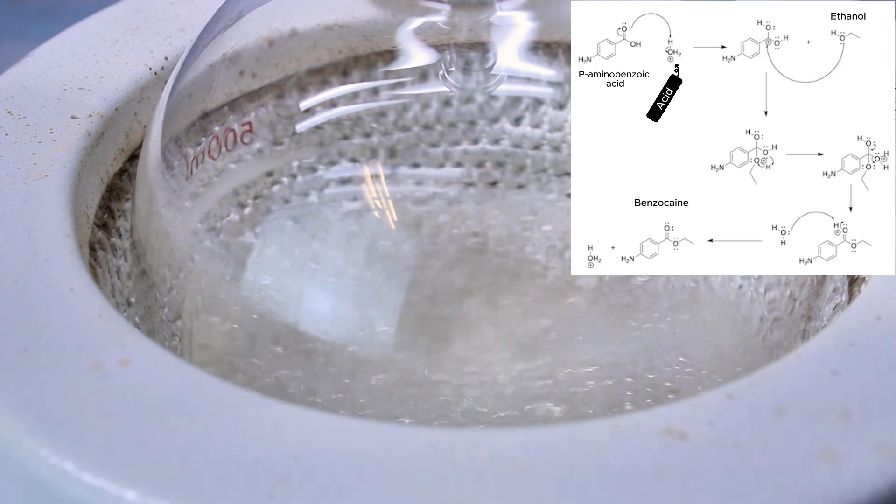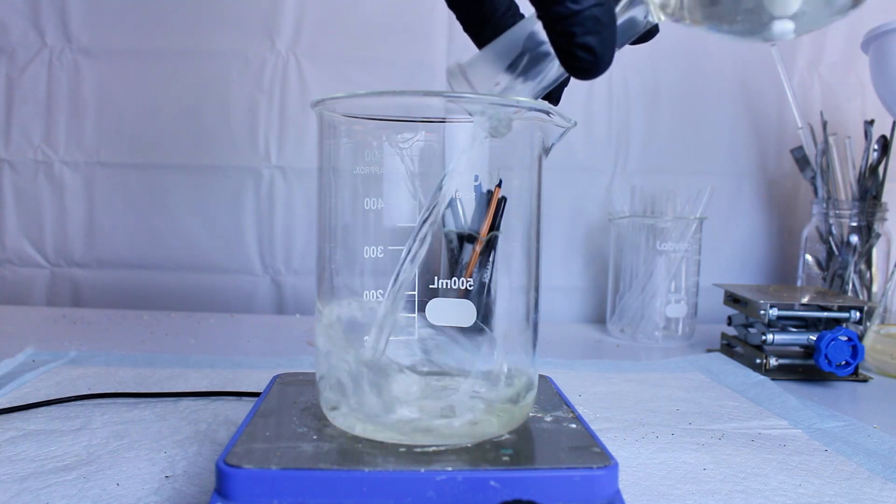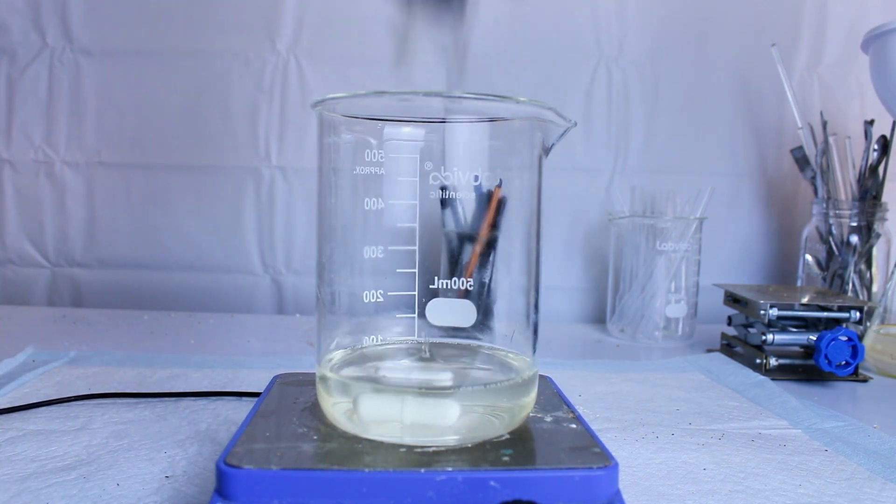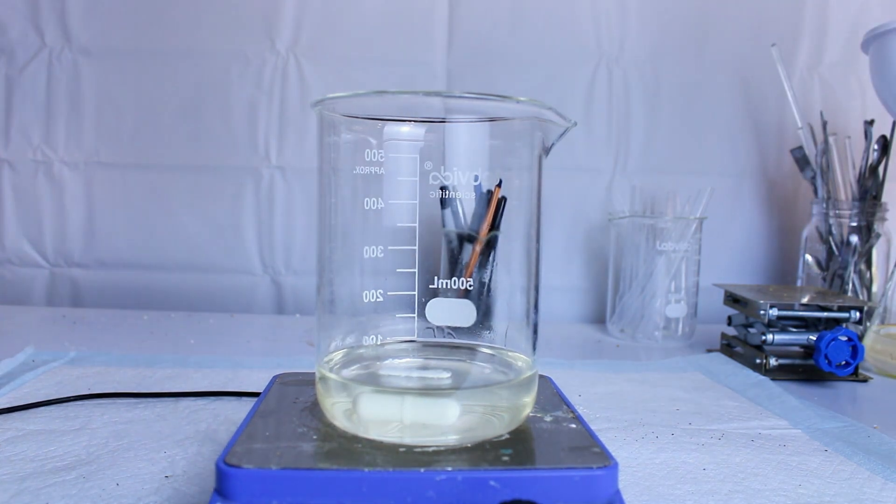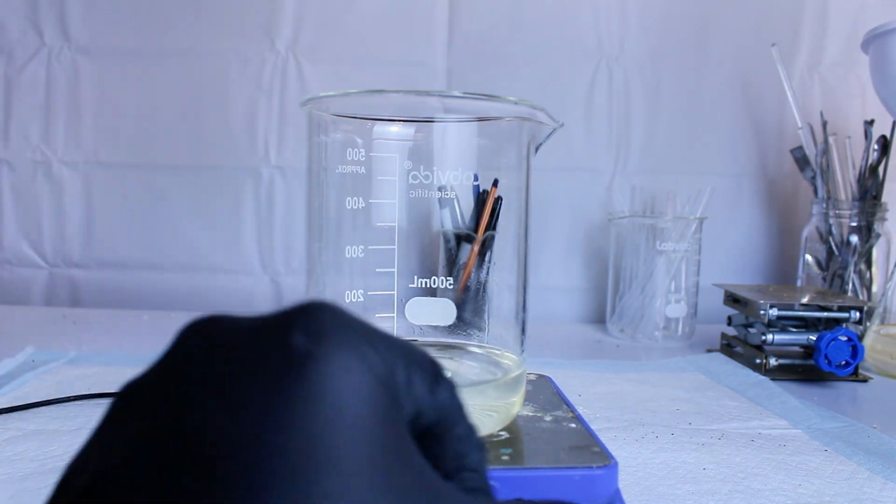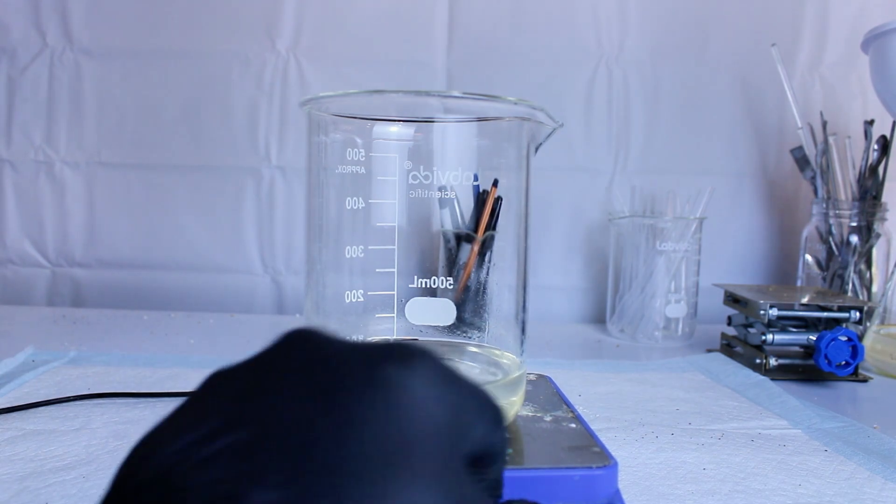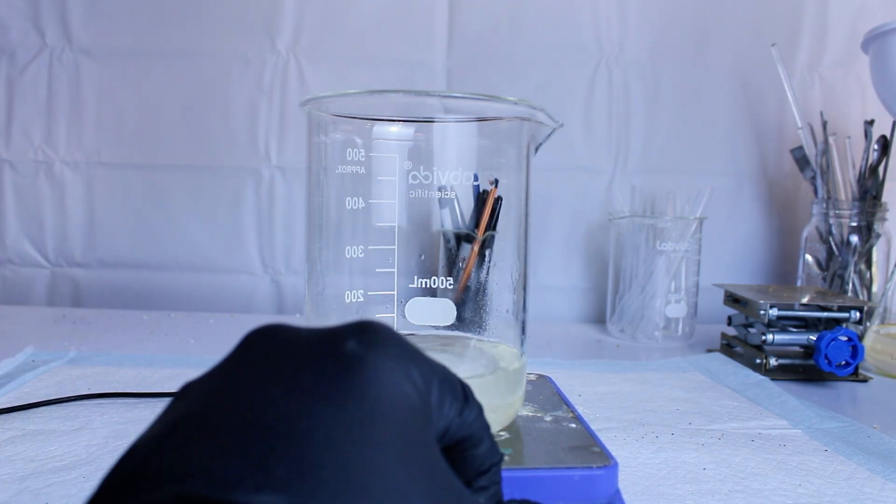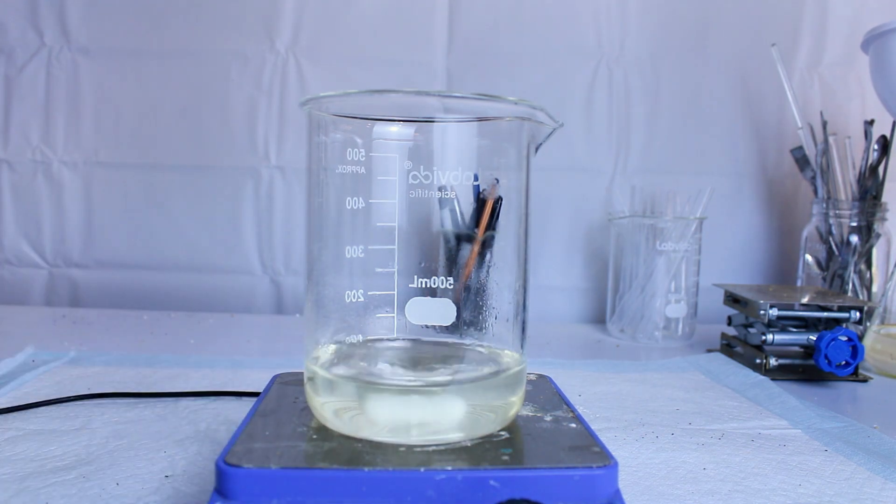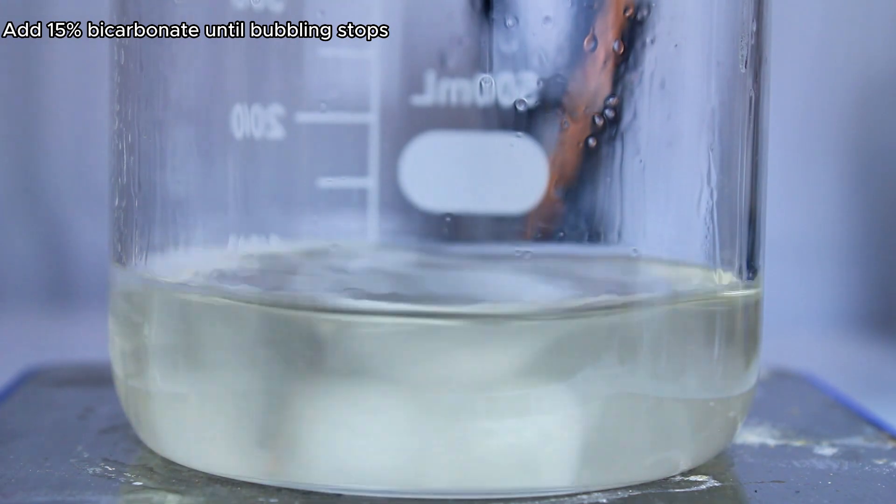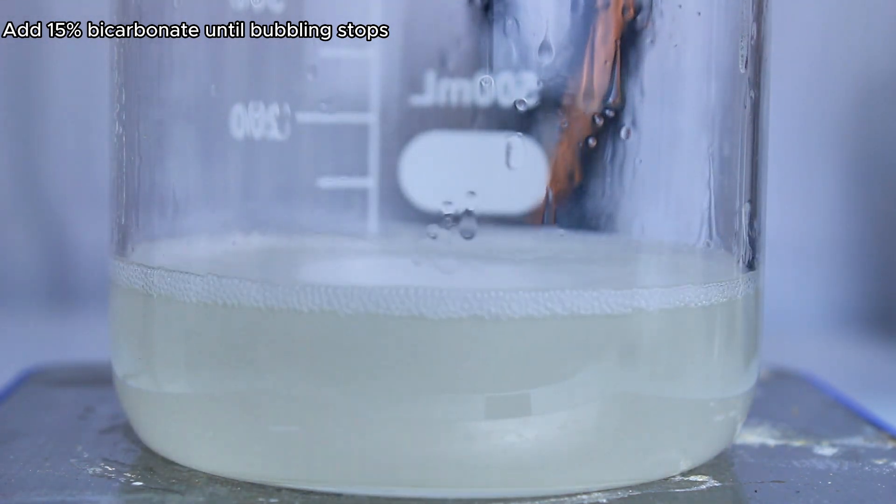This reaction is not reversible, and when the solution turns clear, it's done. Now to actually isolate my product, the first thing I want to do is neutralize all my excess sulfuric acid with sodium bicarbonate. To do this, I mix up a 15% sodium bicarbonate solution and slowly add it to my mixture until no more bubbling occurs. At that point, all the excess sulfuric acid should be neutralized to sodium sulfate, and the pH should be around 8.